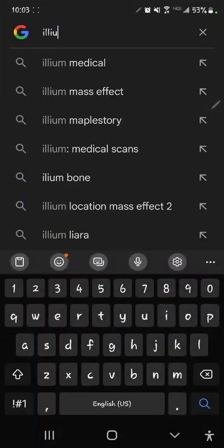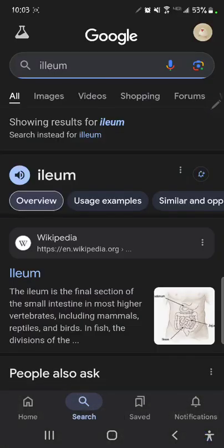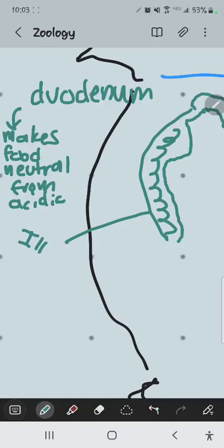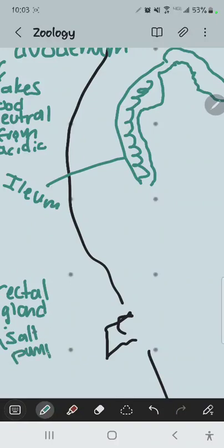At the very end of this structure here, there is an osmoregulatory gland called a rectal gland. I like to ask this on a test because the rectal gland is actually an osmoregulatory organ that basically regulates salt concentration in the body system. So the rectal gland can absorb salts, or it can be used to excrete salts. In a saltwater shark, you can imagine it's excreting salts, because they're excessively salty, so they're trying to get rid of salts. But this is the closest thing to an osmoregulatory organ that they have.